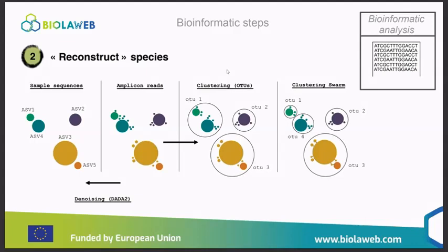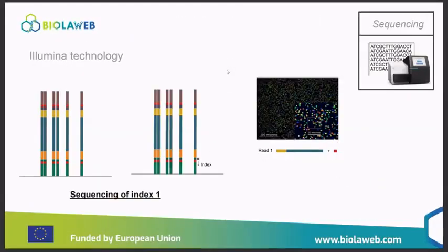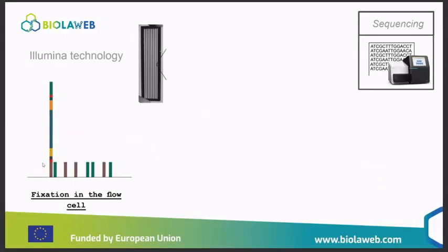So Patricia Naik from India asks, why do we need adapters in NGS? It's because the technology works with a flow cell where you already have those adapters, and you want to fix your sequence onto those adapters, and then they will be present all over the flow cell. It's the way Illumina technology works.